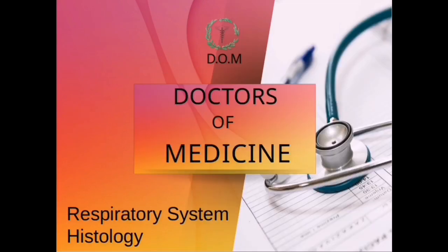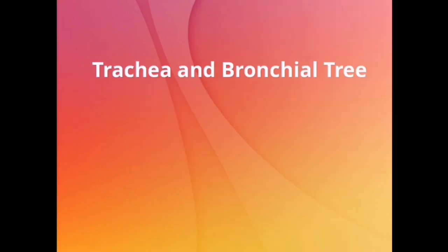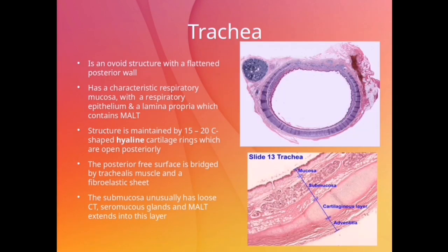In this video, let us look at the trachea and the bronchial tree. So the trachea is an ovoid structure with a flattened posterior wall. This structure is supported by C-shaped cartilage rings. So this is our C-shaped cartilage ring, but these rings are deficient, or not found posteriorly in this region. That's why the trachea is flattened in that region.